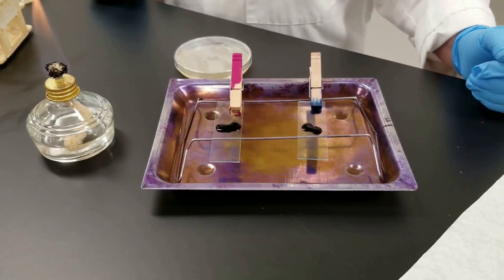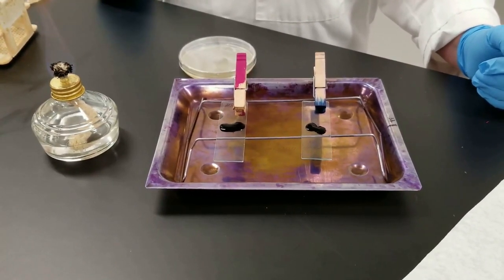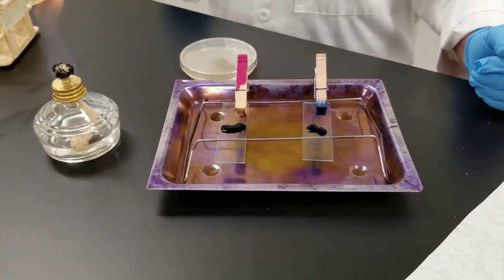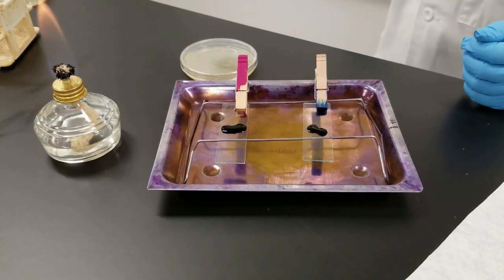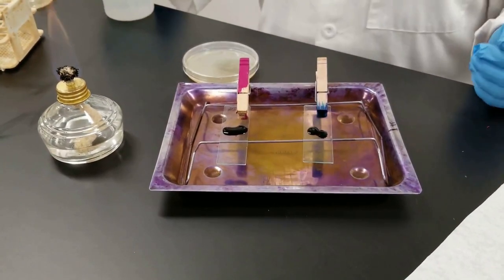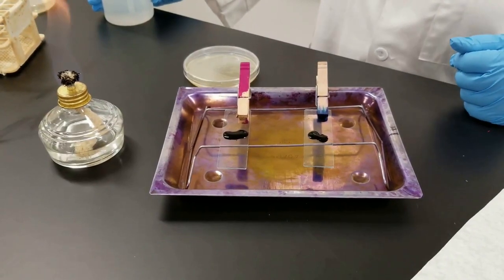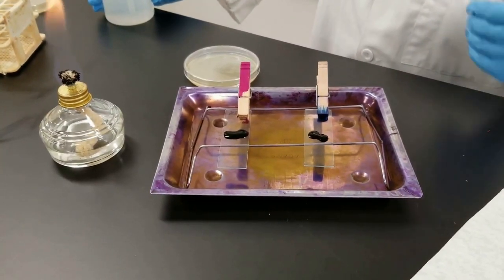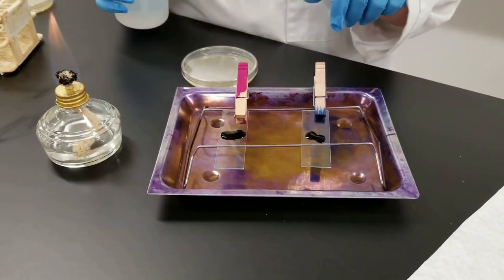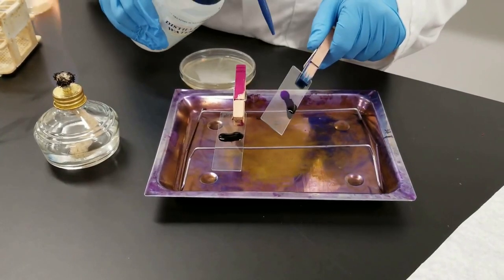This Gram stain is named after the person who developed it. It is probably the most basic and most fundamental and important stain that we do in microbiology. We use it to distinguish between what we call gram-positive and gram-negative bacteria. The differences in the way they pick up the stains through this process has to do with the chemical composition of their cell wall. So the two different main categories, their cell wall composition, is chemically a little different. Now, it's been a minute, so I'm going to rinse gently with distilled water.